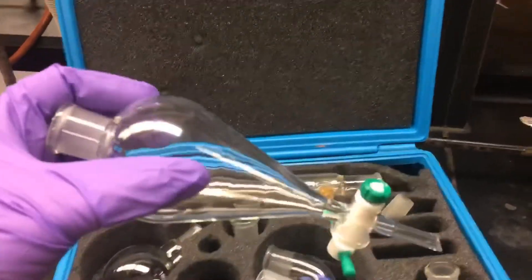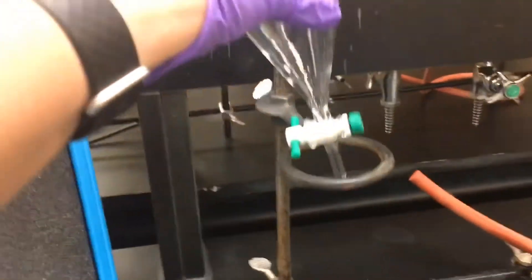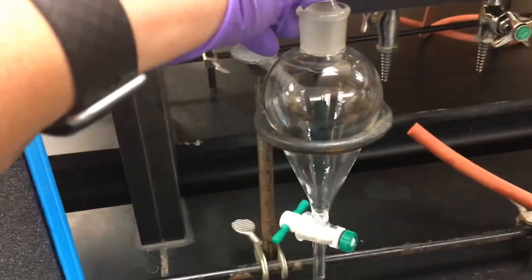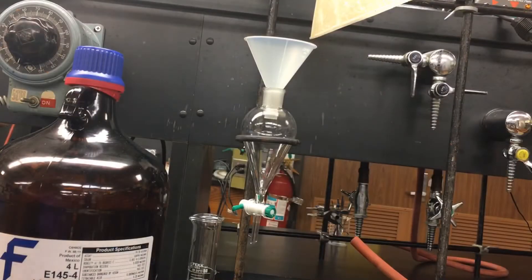The separatory funnel is found in the blue case in your common locker. We support separatory funnels by iron rings. Here I'm placing the separatory funnel in the iron ring and finding the stopper that fits securely.